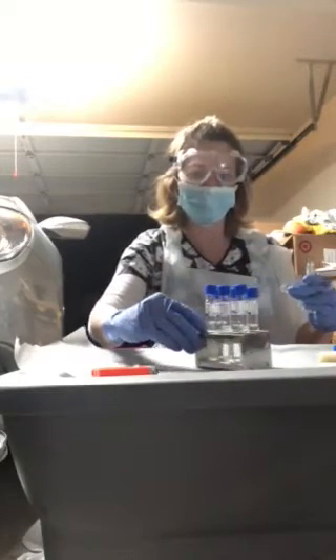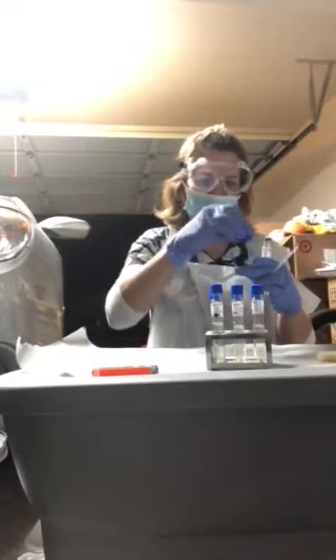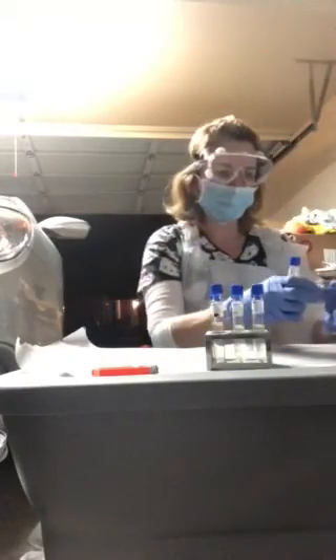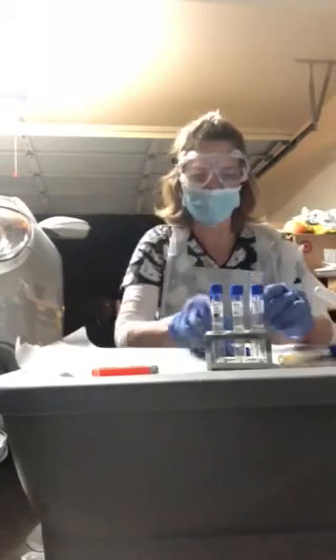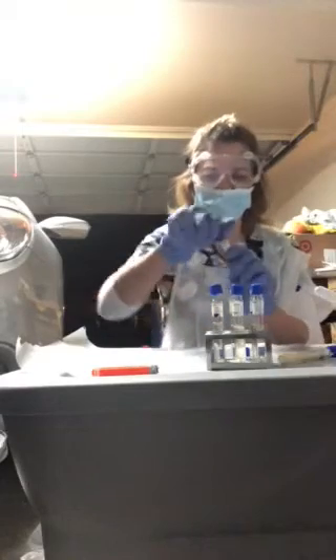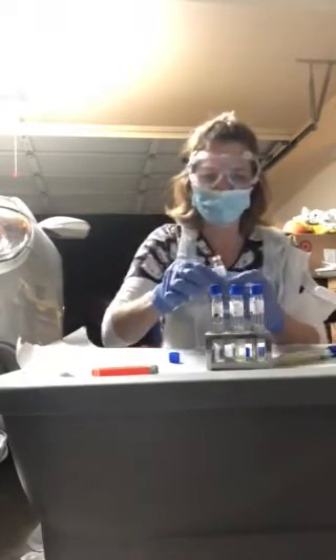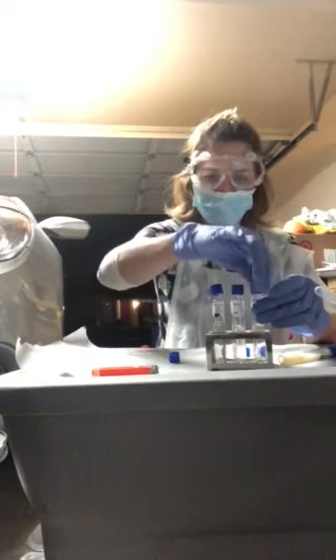I'm putting my cap back on my S. epidermidis and putting that back. Now here is my S. cerevisiae — I'm going to take my caps off, trying not to spill these since my tray is bigger.